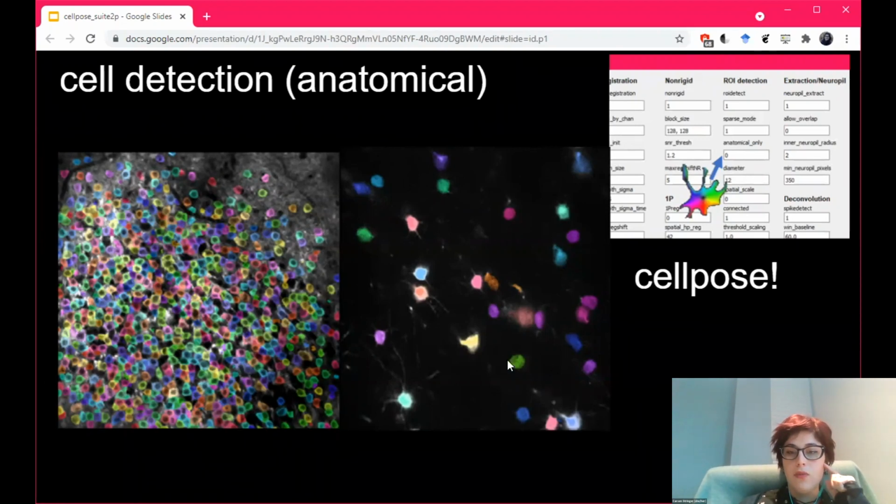And then also for really deep imaging. Here's an example of imaging deep in auditory cortex. These cells are not necessarily all super active. This is the max projection image, so you can see them somewhat, but it can help to do a good job of segmenting these cells that have low SNR, that are deep in the brain, and maybe it will make clearer ROIs than if you try to use the correlation approach. We're using correlations of pixels across time, which might be noisy.